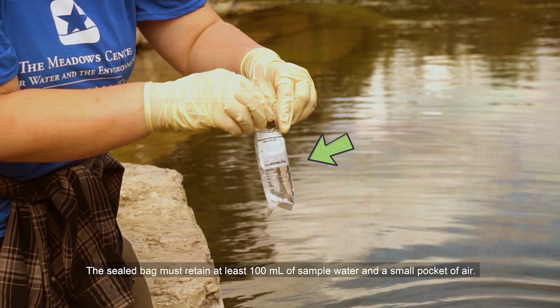The sealed bag must retain at least 100 milliliters of sample water and a small pocket of air. This airspace will help mix the water when it is shaken just before making dilutions and membrane filtration.